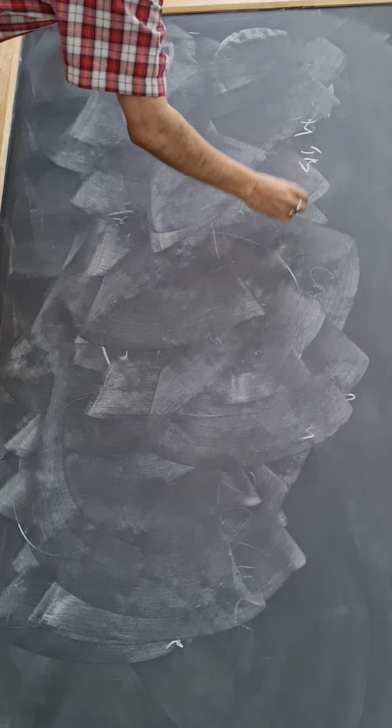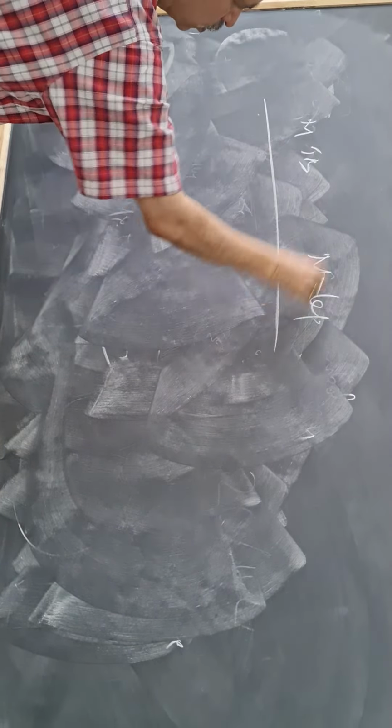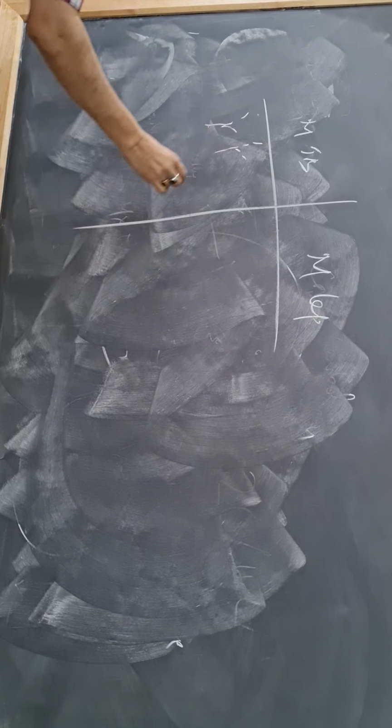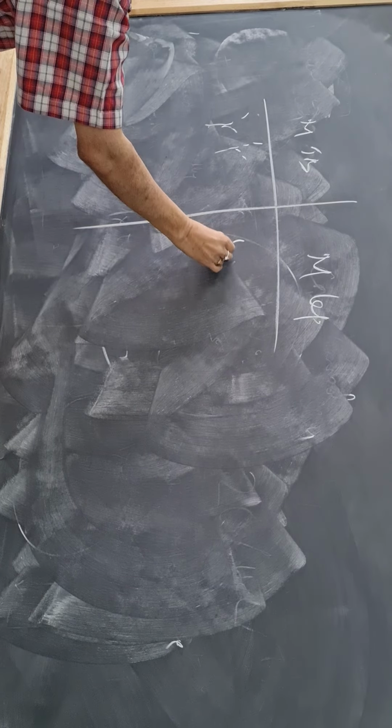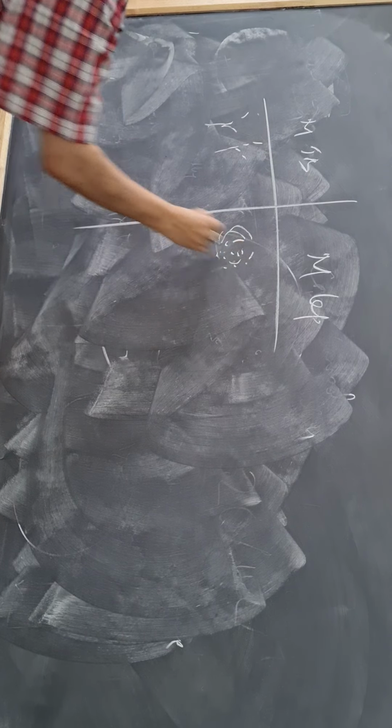So what are the differences between MTB and M. leprae? Mycobacterium tuberculosis is long, slender, slightly curved, branched, with a beaded appearance, whereas M. leprae looks short, stumpy.